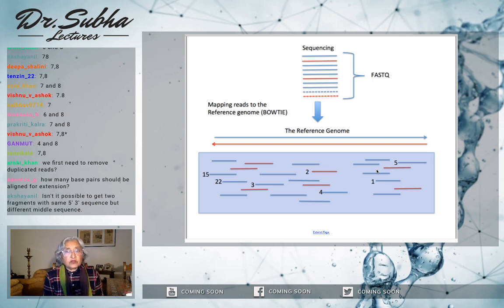Because why would you want to keep searching again and again? A loop of 20 million is much faster than 30 million loops. You always remove the duplicates just because of the computational footprint. You want to keep it safe because these are large numbers we're talking about. They don't hurt the assembly, but they hurt the computing time.